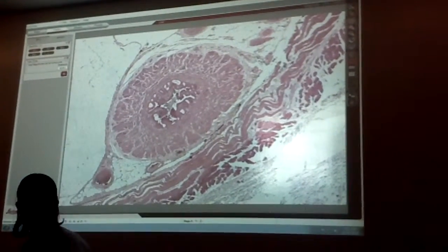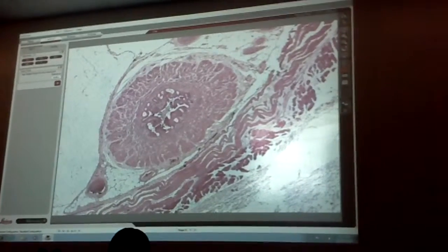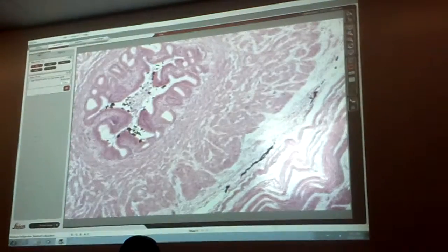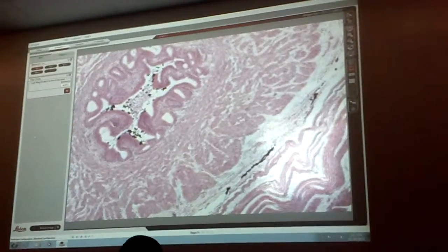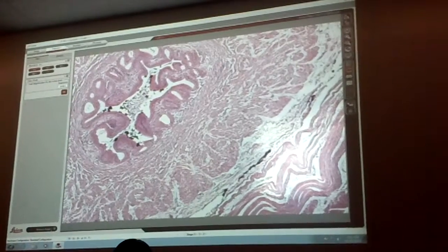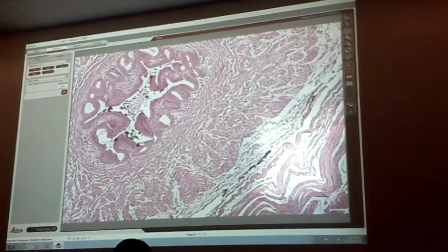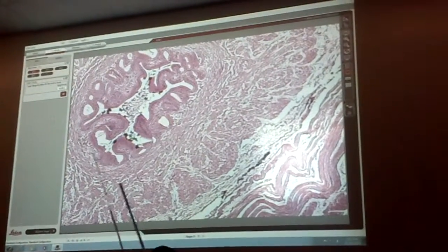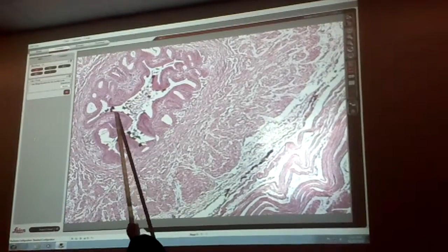On this one, it looks a little different. The inside of the lumen is a little trickier, all folded in on itself. So again, we have the PSCCE all up in here.